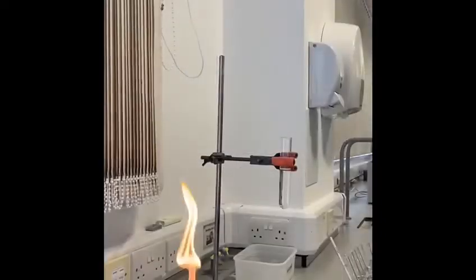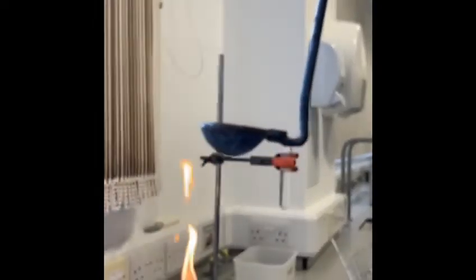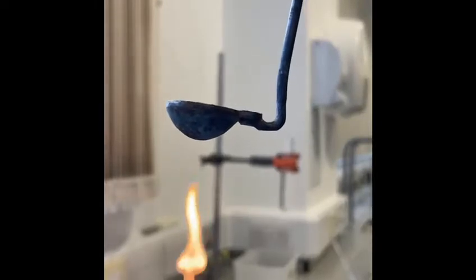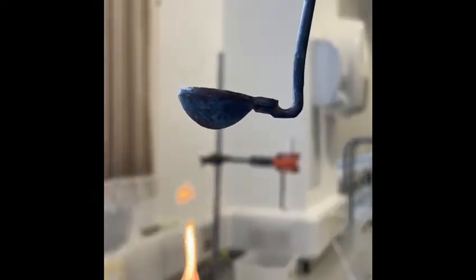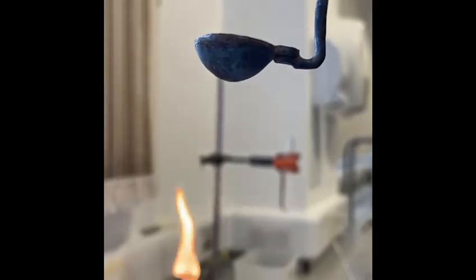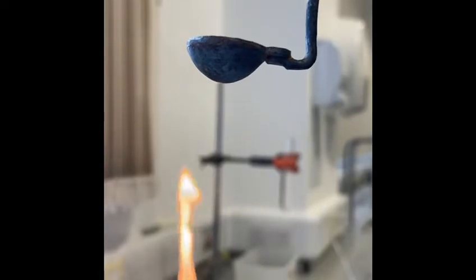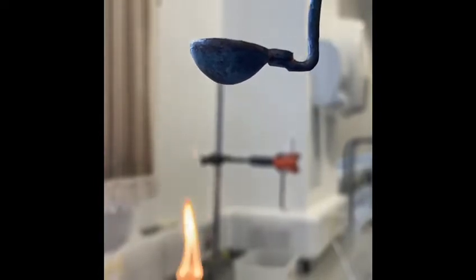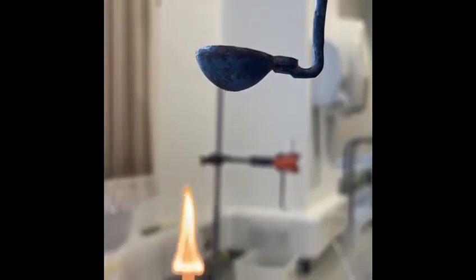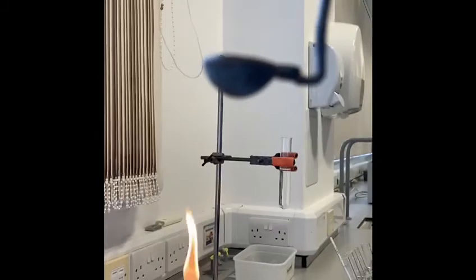For the investigation to work, the deflagrating spoon should be used to collect a small volume of each food content. You are then going to hold your chosen food over the Bunsen burner and let it burn for 2 to 3 minutes. Following on from this, having burned the food, you're going to remove it from the heat source and hold the deflagrating spoon underneath the boiling tube and allow the heat energy being released to warm up the water.